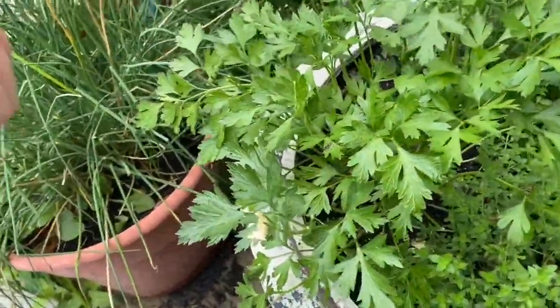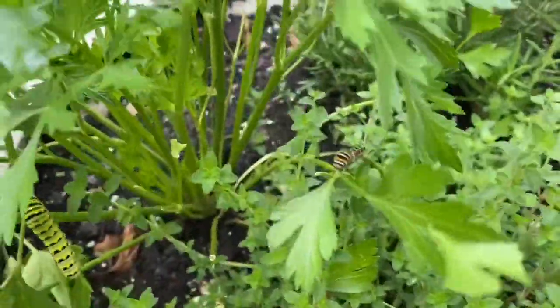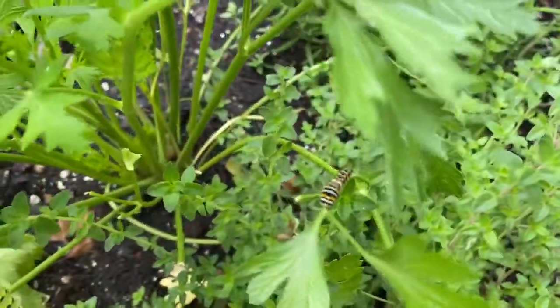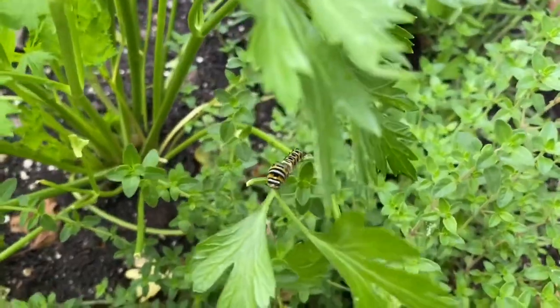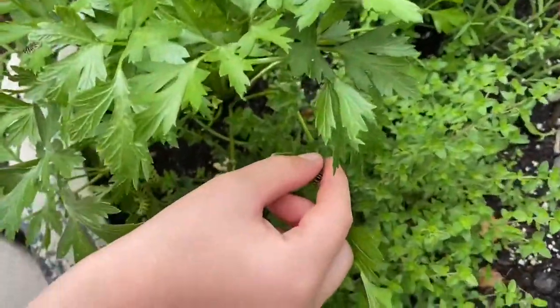There's a couple other of these guys — that one's about his size and this is like a younger swallowtail caterpillar. It was pretty much all black just a couple days ago. Are you sure that we shouldn't put this caterpillar poop leaf under the microscope? No? Why not?